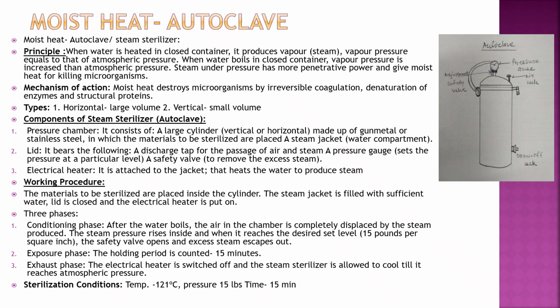The principle: when water is heated in a closed container, it produces vapor and then it causes vapor pressure. Then when water boils in a closed container, the vapor pressure is increased more than the atmospheric pressure, and then it has a more penetrating power to kill the organisms. And the mechanism: killing of organisms by irreversible coagulation and denaturation of enzymes and proteins.